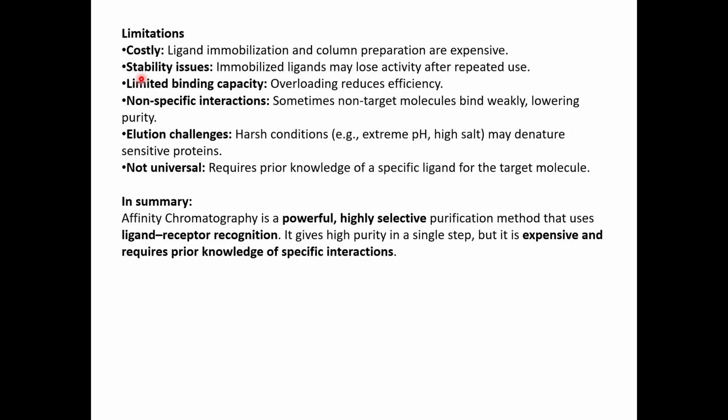So if you do not know how to run the column, how to store the column, how to regenerate the column, it can be difficult to maintain it, and the column might lose its stability, and then you cannot reuse it properly. So these columns can range anywhere between thousands to lakhs also. So when you have such expensive columns, and if you're unable to maintain them properly, it will be such a waste of resources.